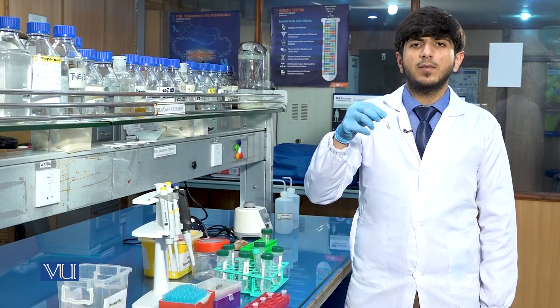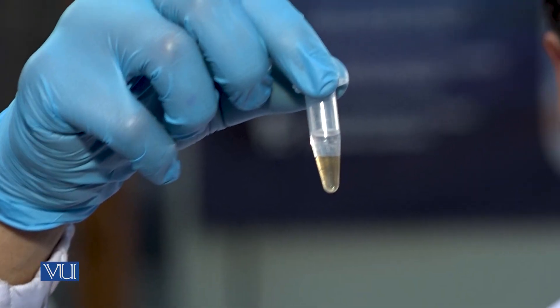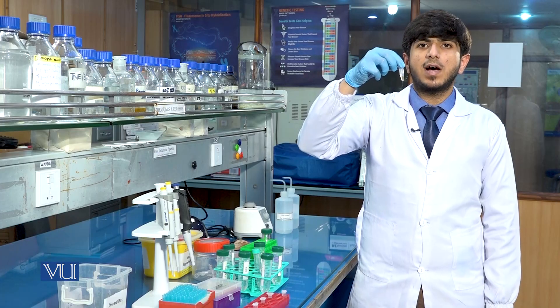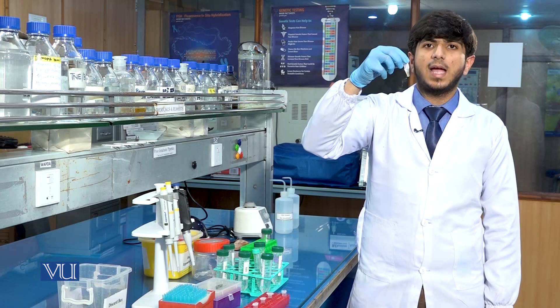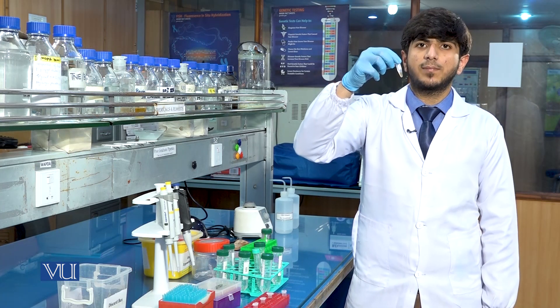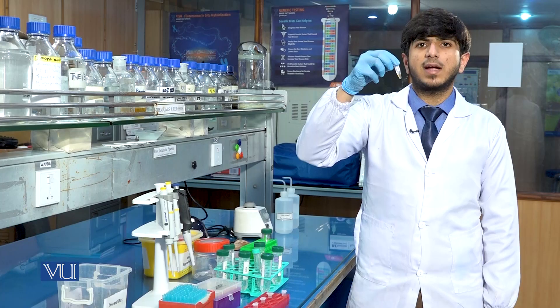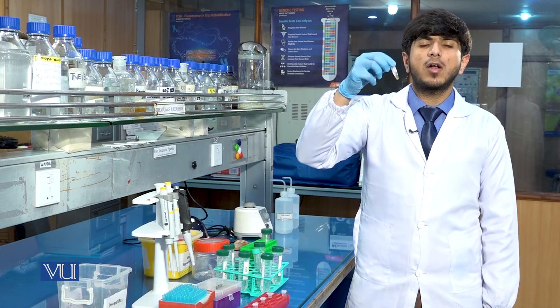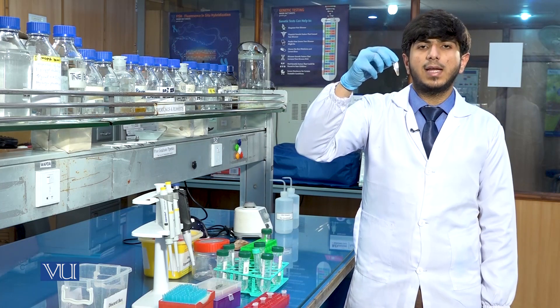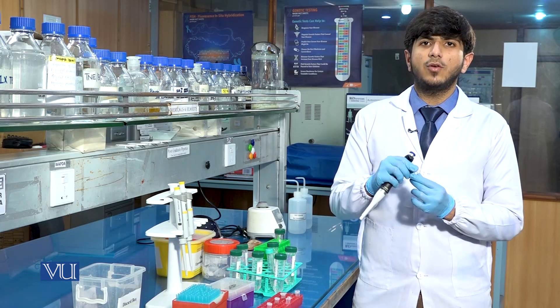After the centrifugation, you will see that there will be phase separation in the tube. Because PCI is an organic solution, it separates the DNA from the protein and makes distinct layers. The lower layer, which is at the bottom, contains the debris and the proteins. The debris are the worn-out parts of the cell, and the upper aqueous phase contains our DNA. We will transfer the upper aqueous phase into a new Eppendorf tube.